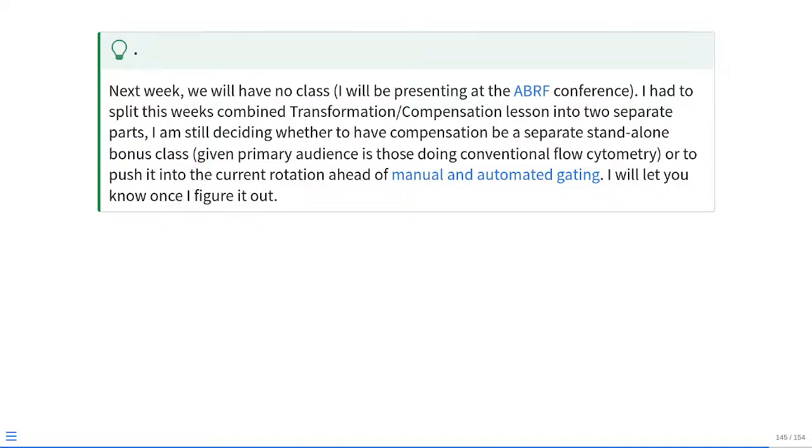We will still cover how to do compensation, but I just don't know if it's going to be in the context of our 30-week schedule or it's going to be a one-off that for those who are interested can go and check out.